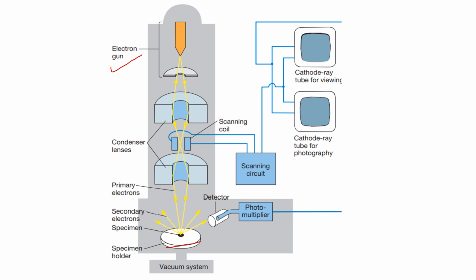The pointed primary electron beam is hitting our specimen, secondary electrons and X-rays, you know them, are detected, and then the scintillator and the photomultiplier. Now that part of working and the parts of the scanning electron microscope is completely covered. Nothing is left out.